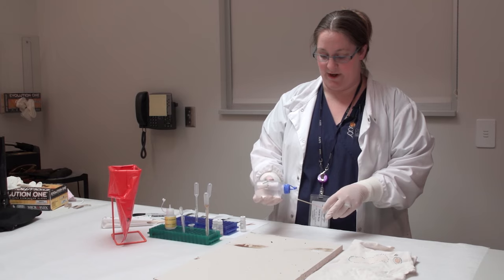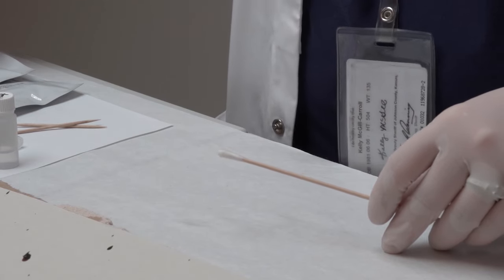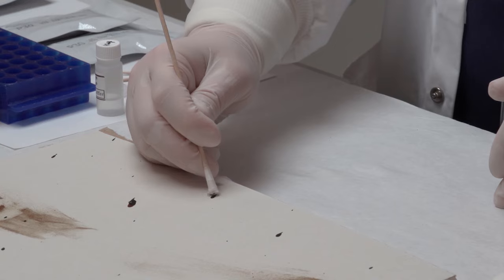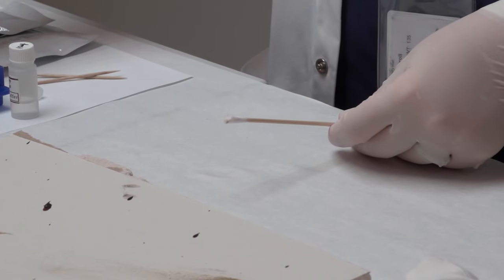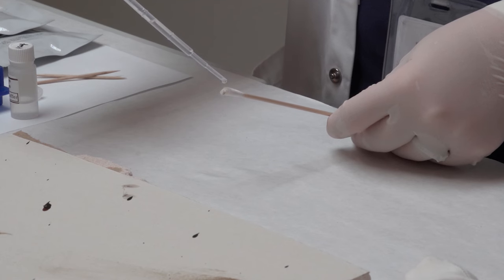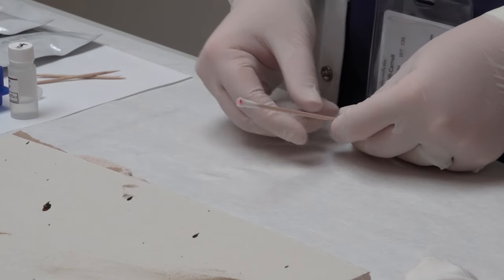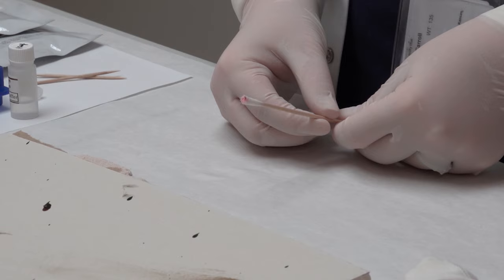The first test we're going to do is the phenolphthalein test. We take one drop of sterile water onto a sterile swab - that's enough to pick up any blood we want to test, just enough to be able to see a stain. Then we add one drop of the phenolphthalein and one drop of the hydrogen peroxide. It should turn a nice bright pink color very fast, within 10 seconds. That means we have a positive test and gives us a good indication that we're dealing with blood.